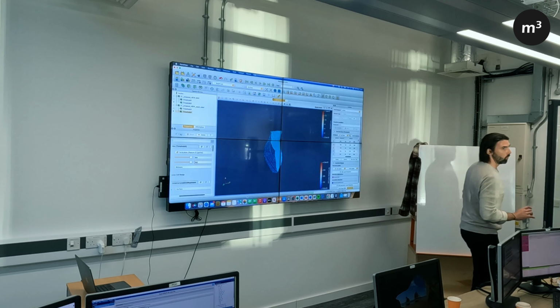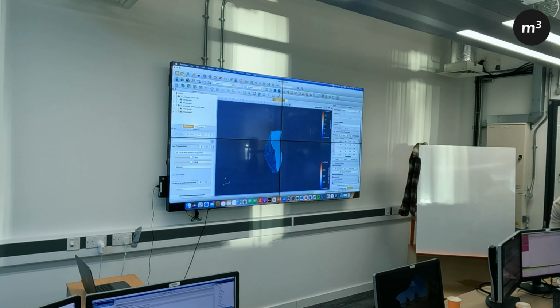That will bring up all the face labels with a 164 on one side of it. Okay, so that's a nice grain boundary segment. It doesn't look very smooth, and that is probably because in my example pipeline, I only iterated once because I was rushing yesterday. So because we've only done one iteration, it's basically voxelated.